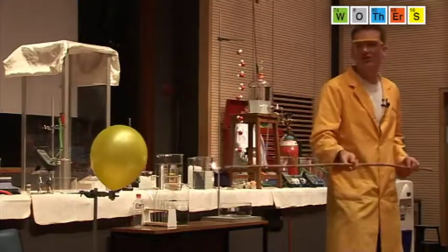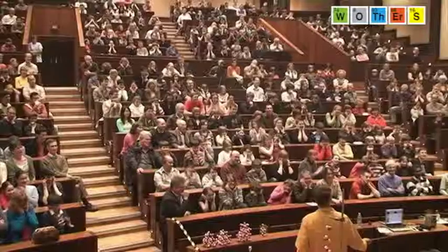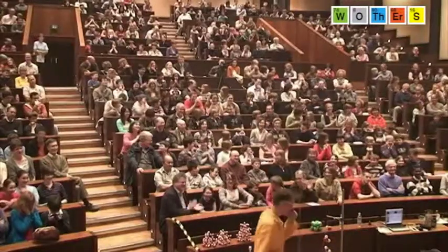Well, let's try this one then. This is 2 parts hydrogen, 1 part oxygen. And that was pretty loud.